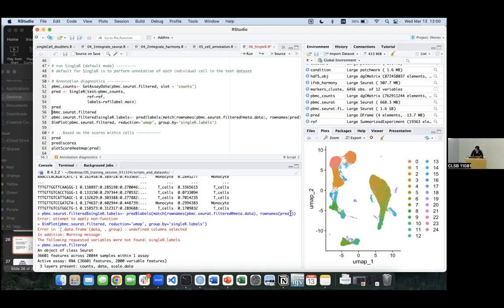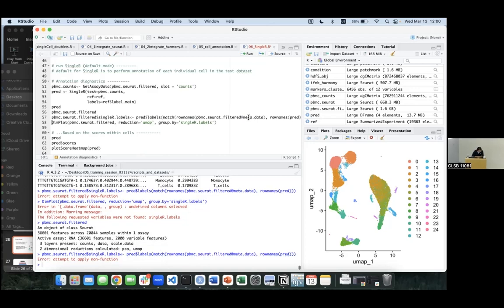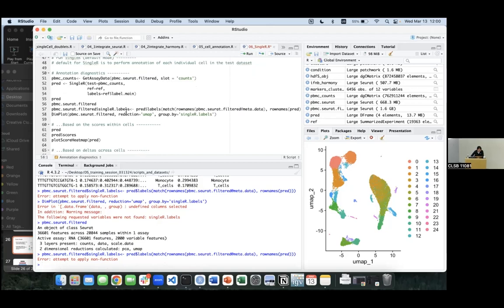Match. Running. Is it meta.data? Yes. Yeah, feel free to go have lunch.